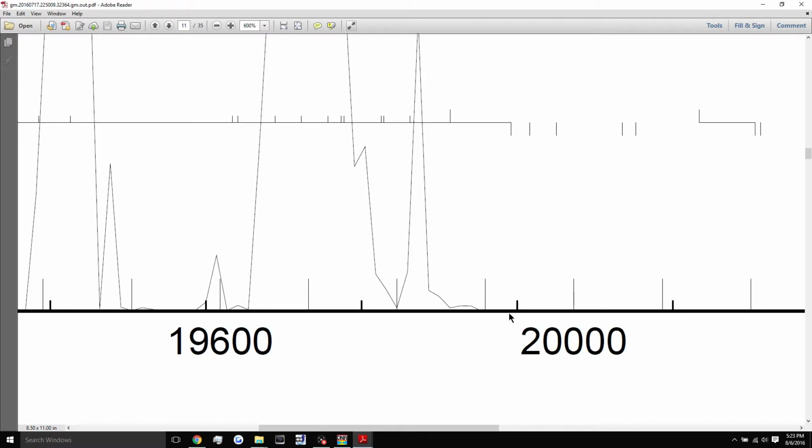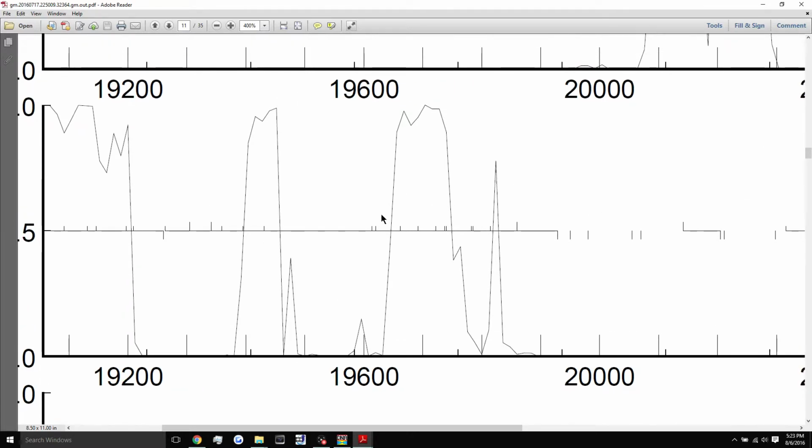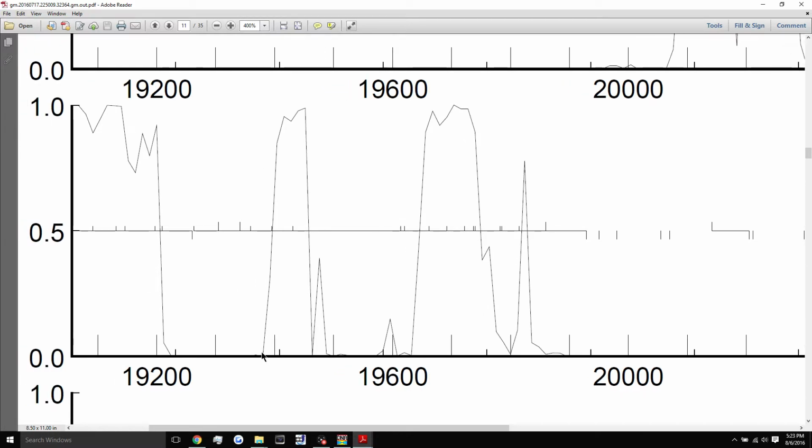Perhaps look on a different output. This was SMEG output, but you could do a TB output on PhagesDB and try to see if that had any coding potential, but it would just be a red flag. But since we do have spikes here, we have some nice coding potential, little regions here that go all the way from our start to stop site. We would say that this includes all coding potential because all the spikes and all the little area under these spikes fit in between our start site and our stop site. So this would be a good example.